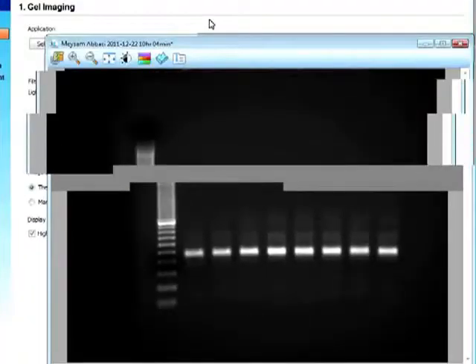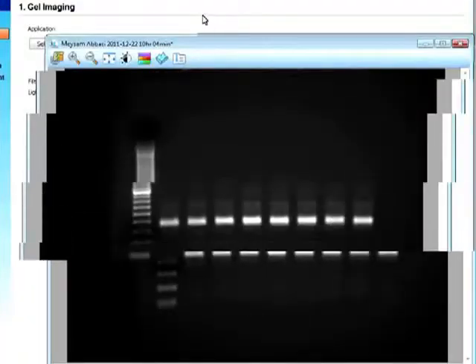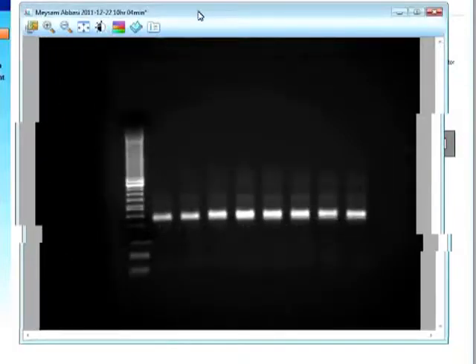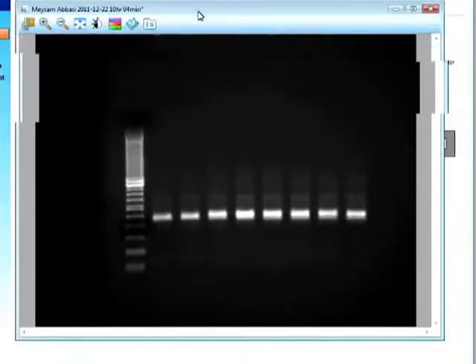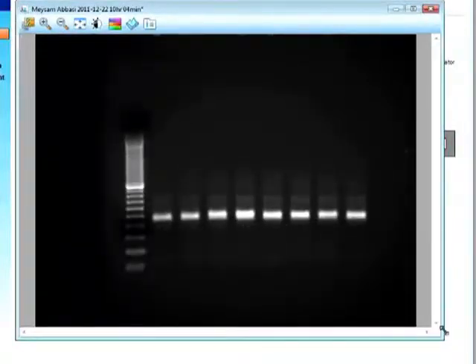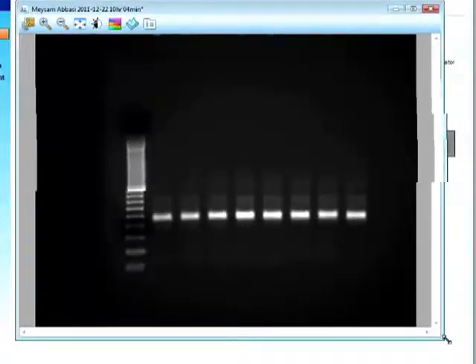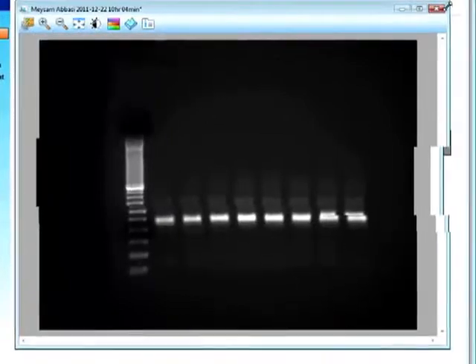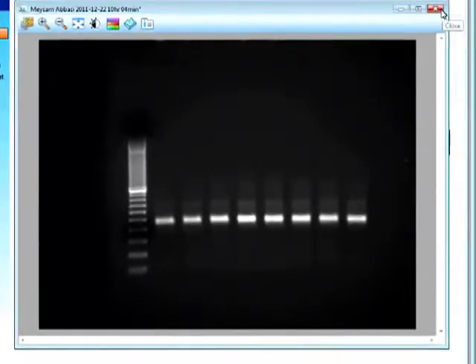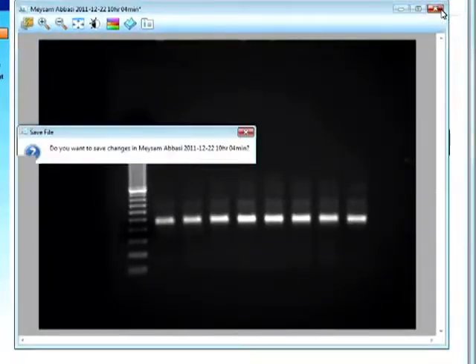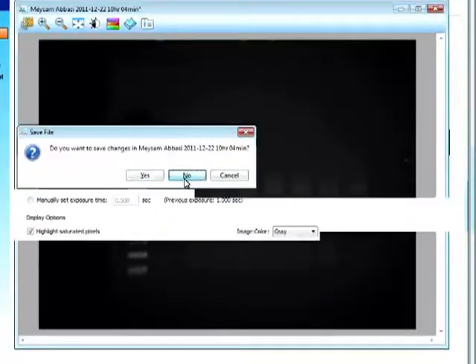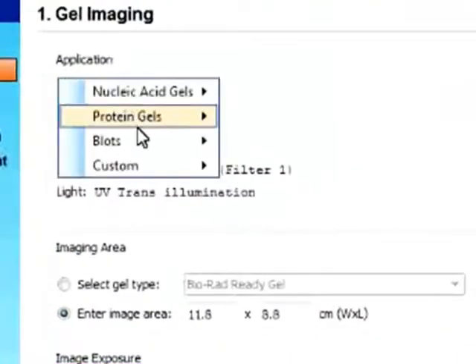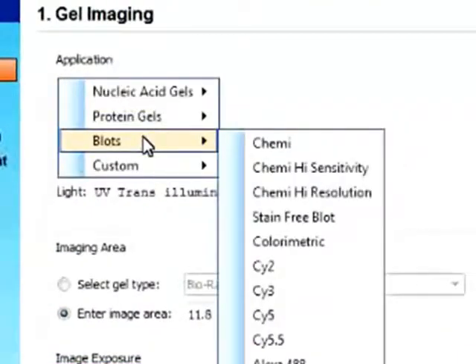And then run the protocol. And there we have our image. And this is how easy it is to acquire an image of a nucleic acid gel with our ImageLab 4.0 software.